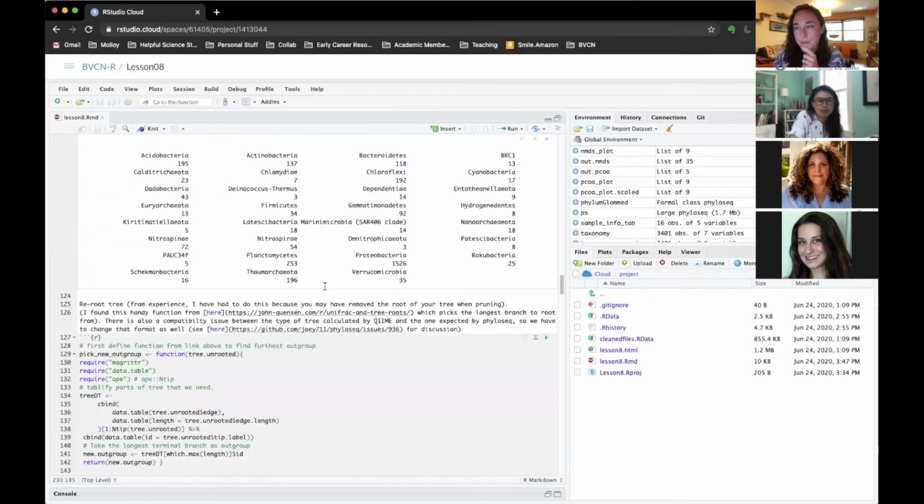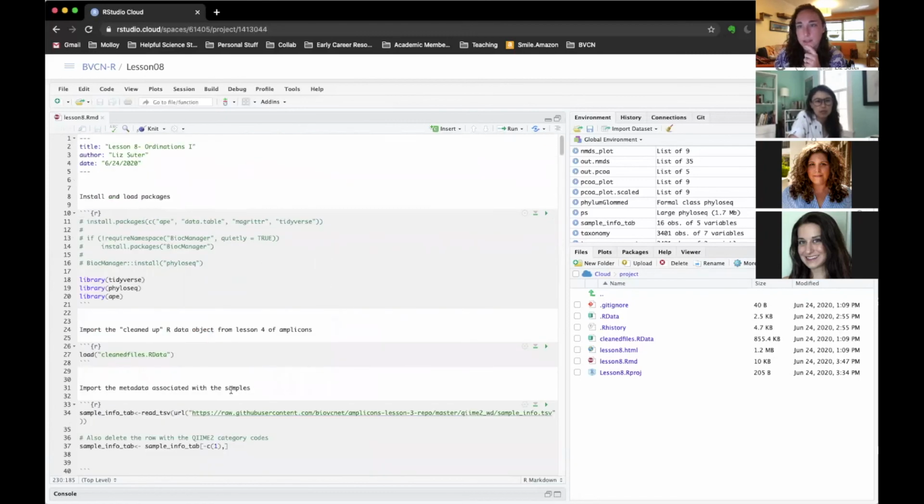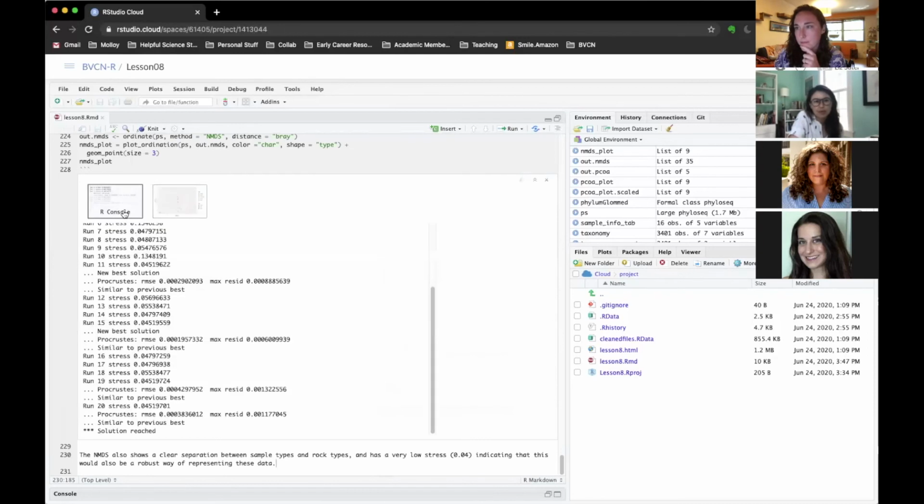I have two quick questions for you. Sure. So the stress that you last showed was really interesting to look at. Is that one of the primary ways that you decide on the method and the distance for the ordination? Yeah, good question. I know that's kind of a loaded question in some cases, but yeah.